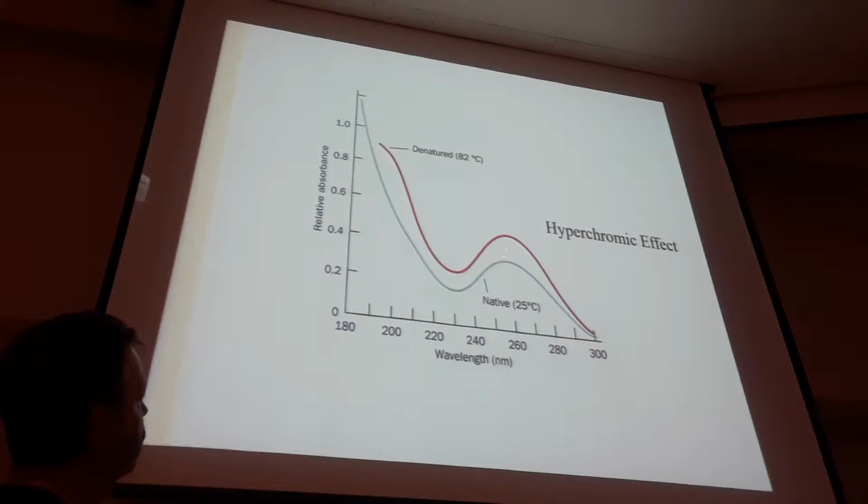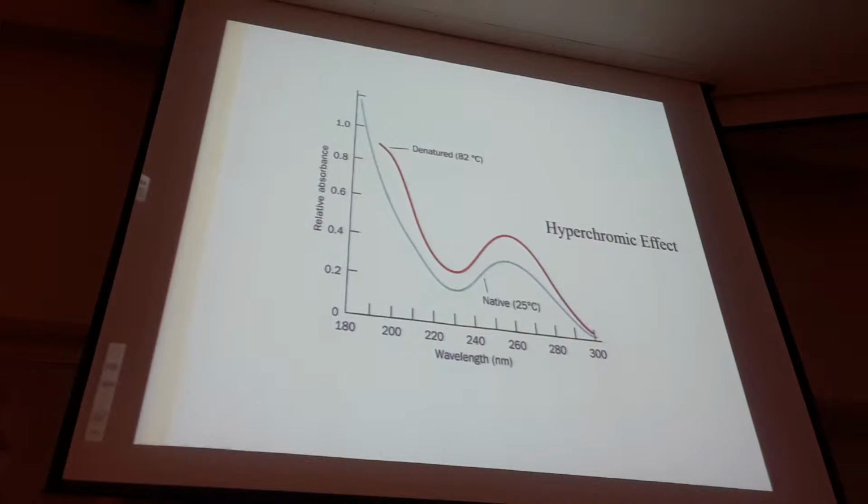from one measurement point to the next, you will have an increase in the absorbance at 260 nanometers. Okay? Up to a certain point where you do not get further increase of absorbance. What you have done is you have separated the two strands into single strands, utilizing heat, and you can say that you have melted the DNA. So this strand separation, in particular if it's based on heating of the sample, is known as melting.